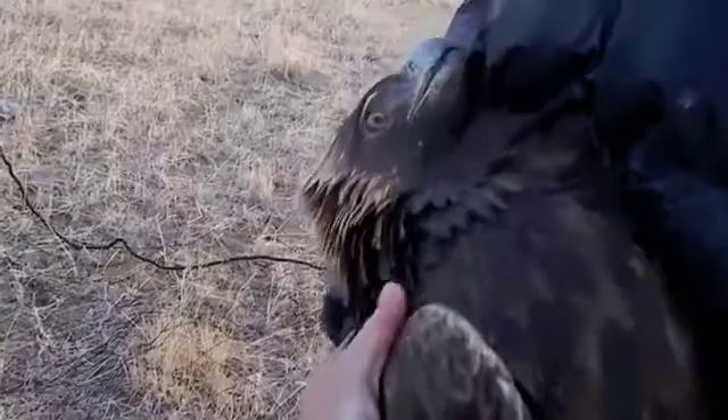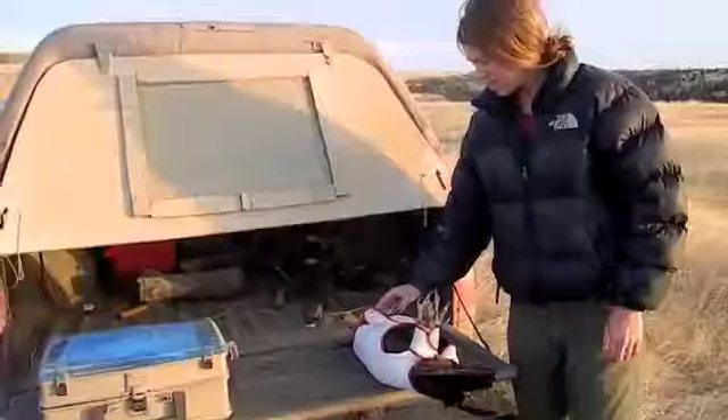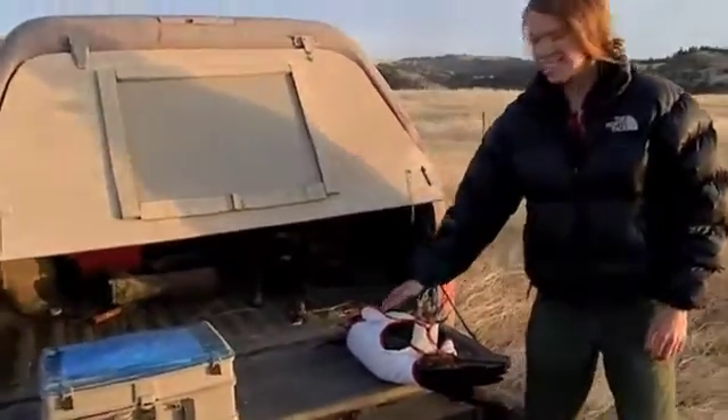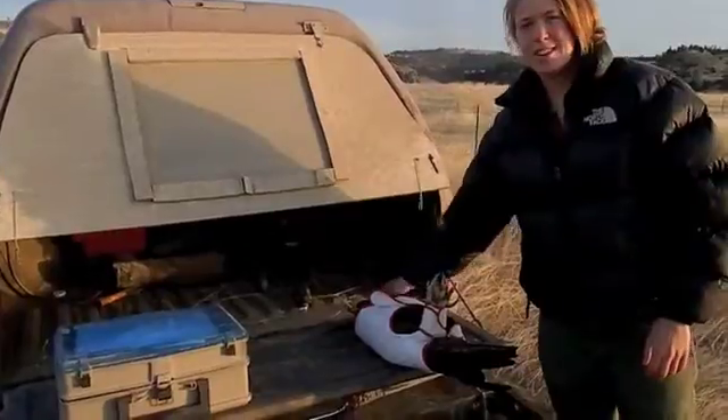This is kind of nice. Alright Kathryn, now that you've caught an adult male golden eagle, what are you going to do? Take some measurements, take some blood, get some photos.